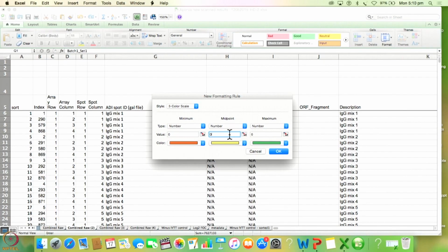Okay, so I am going to say 0, and I am going to assume that my entire data falls between certain negative values and maybe around 80,000 as my maximum value. If my data falls in this range, I am going to split my data based on 3 numbers: 0, then my midpoint, say 20,000, and my highest, 40,000.